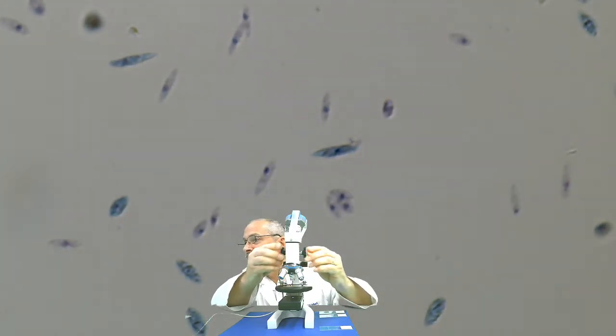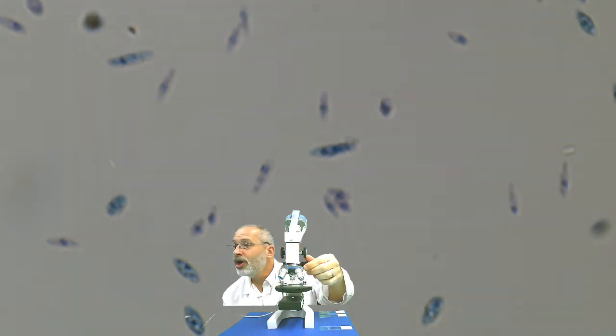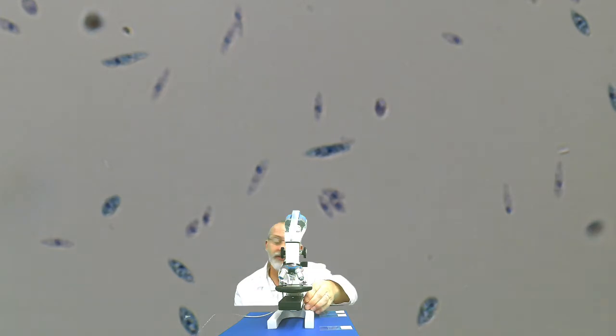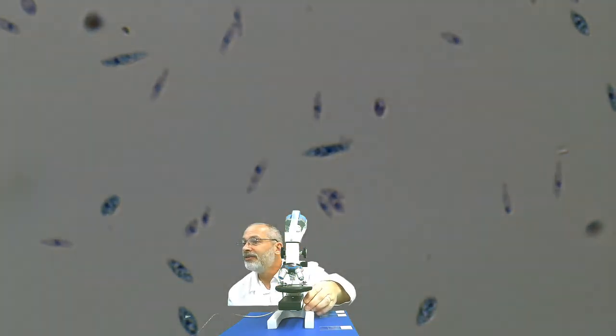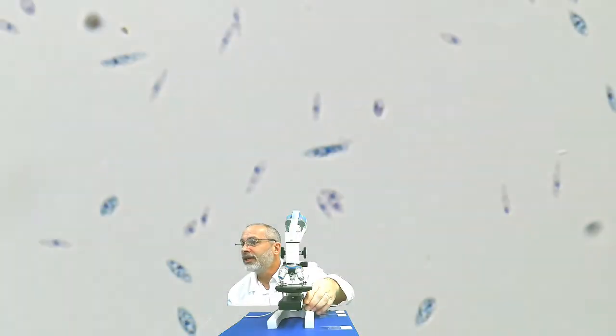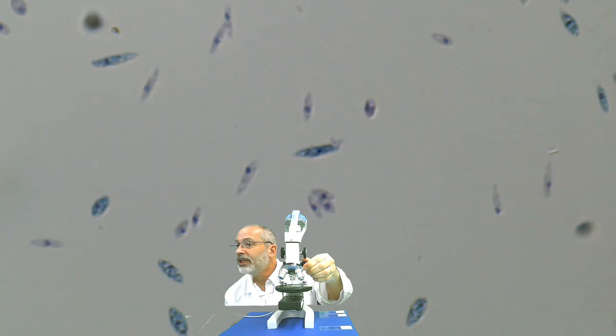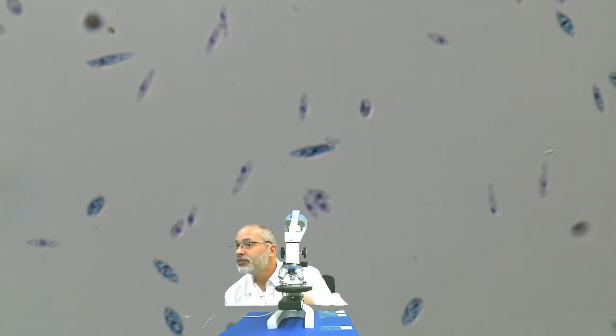So I'm going to give you some time to draw and illustrate what you see with the Euglena here. And again, notice the relative size of the Euglena in comparison to the other protists. Notice the relative sizes of these Euglena. And there are quite a few of them on this particular slide. So take a moment and draw Euglena.